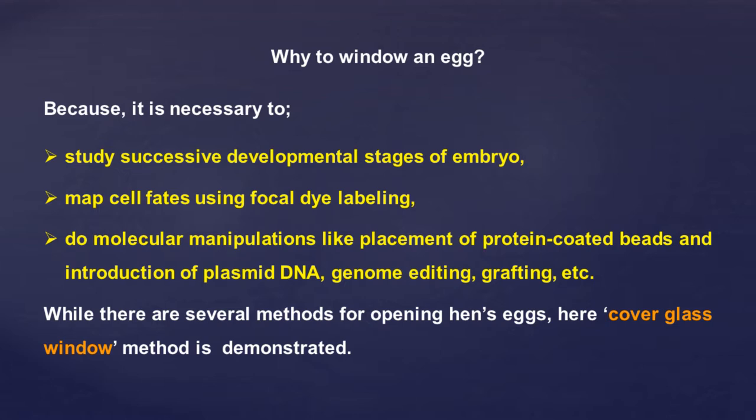While there are several methods for opening the hen egg, here the cover glass window method is demonstrated.